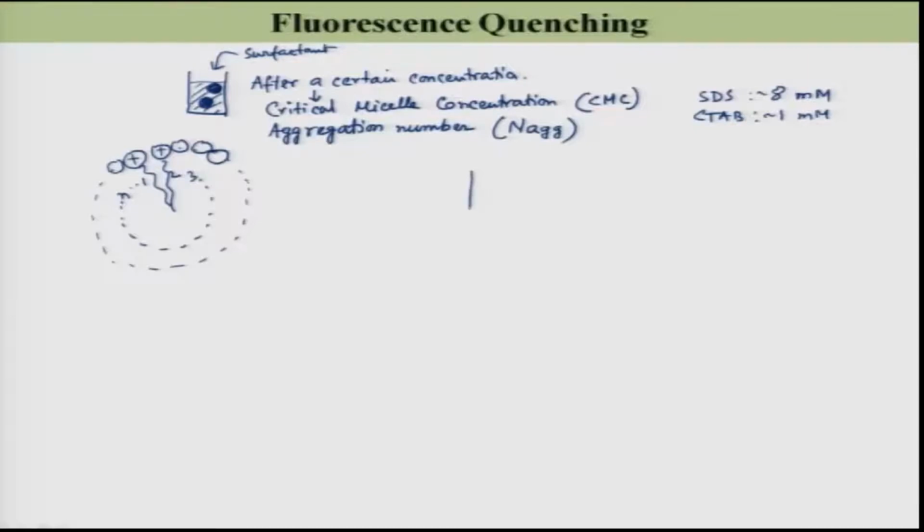For the measurement of the CMC, see the situation. I have a solution, let us say this is water, and let us take one fluorophore inside this water with some concentration.